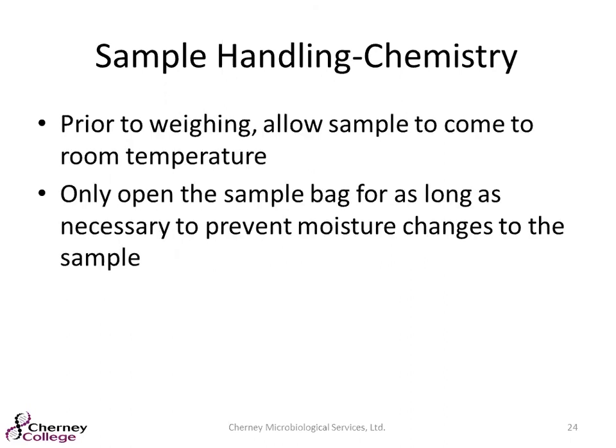So again, like I said, prior to weighing, you're going to want those samples to sit out at room temp. And if you have to do micro and chem, do your micro first, then your chemistry. If you have a moisture test, do your moisture test first for the chemistry side, because opening that sample bag for too long can really change your moisture results.